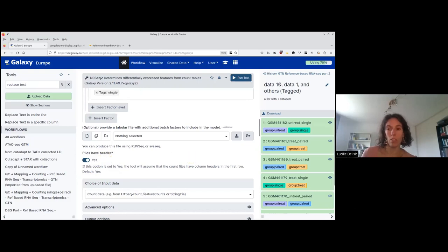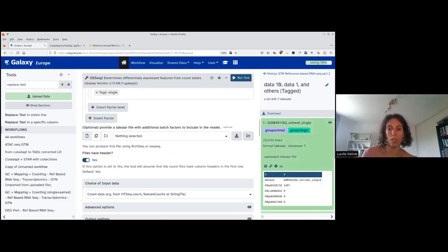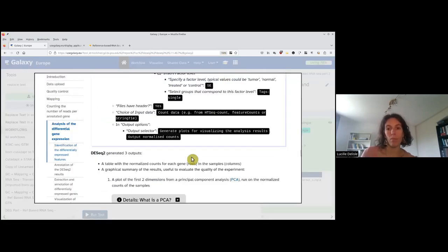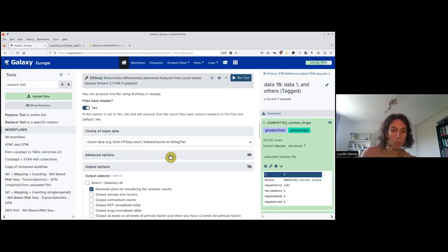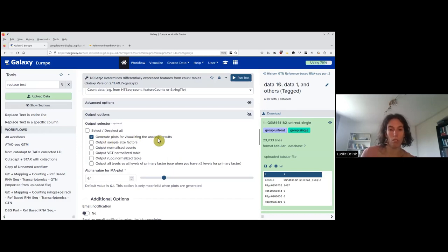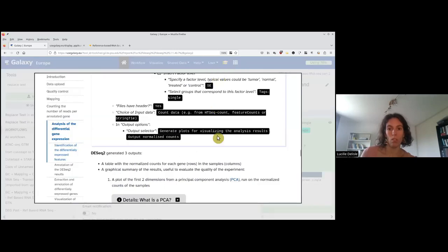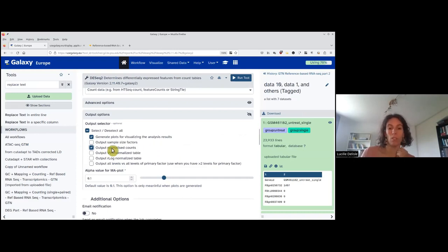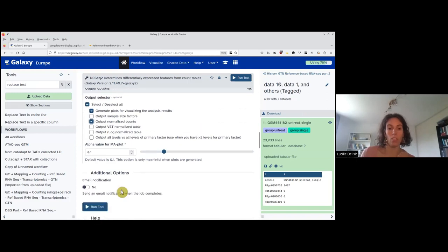Do the files have a header? I click to check — yes, these files have a header, so I put yes. Which type of count are they? They are featureCounts. In the output options, I want to have the plots and the results. I also need to have the normalized counts. As I said, DESeq2 uses a normalization that is not FPKM or TPM, because it takes into account the library composition. So we're interested in having this normalized output.